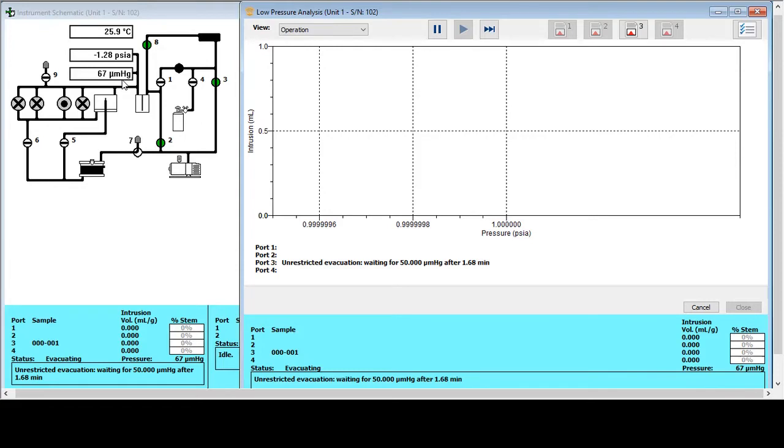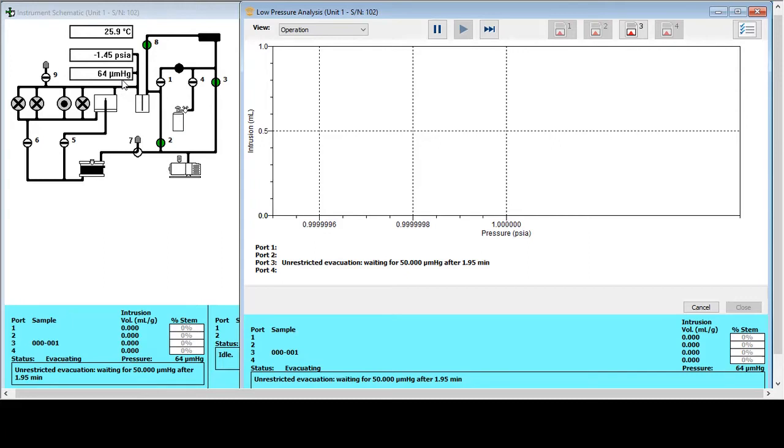Now a full analysis will take around about one and a half hours, anything up to four hours. It really depends on the exact analysis being required and how porous the sample is. The more porous the sample, the longer the analysis time is going to be. So we're going to leave this stage at the moment. It's getting very close to the 50 microns, but we'll come back once the second stage is underway.